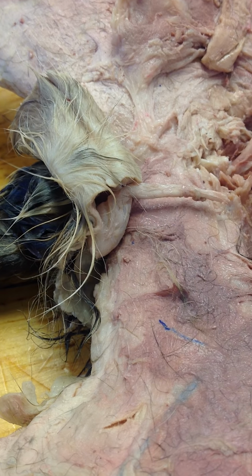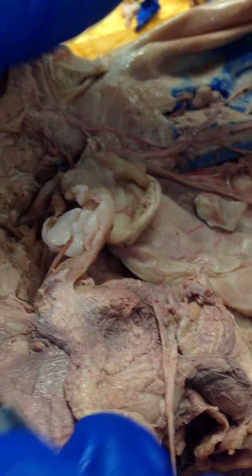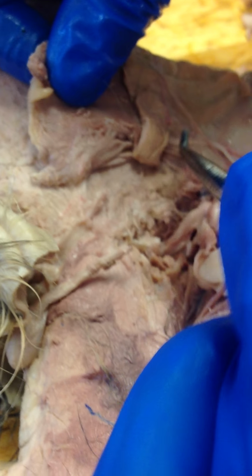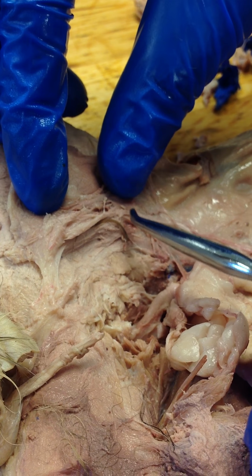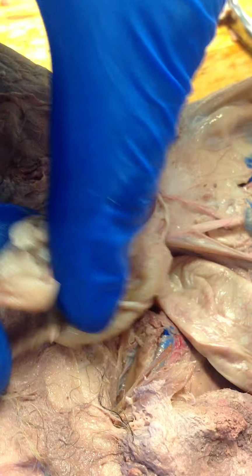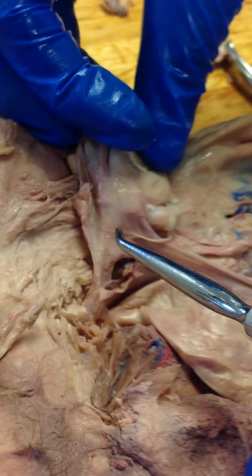Next up is moving this thing away. Ductus deferens. We didn't actually see that; the TA suggested it was inside the epididymis. It does lead up into the spermatic cord. This is part of the spermatic cord. There's another part here, which runs up through here and, if they weren't severed, would come out here. That's more spermatic cord, and it loops around the ureter and ends up joining with the urethra. So it's this thing right here.